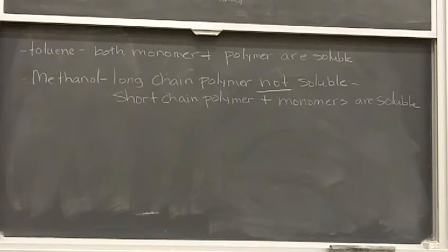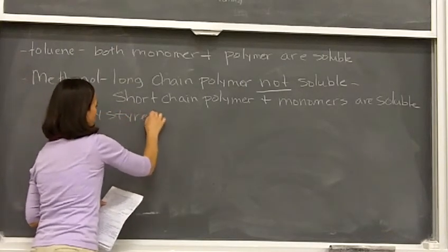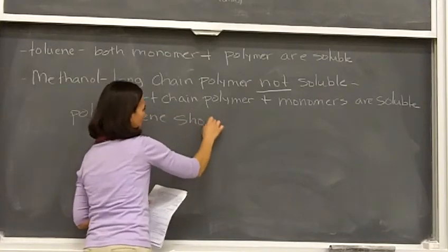Now with that precipitation, you also want to be careful. That's why I tell you to do it slowly, because you don't want to get any globs or big globby masses floating in the methanol. What that means is things were poured in too quickly, and the toluene itself is kind of stuck on the inside of the methanol. So you get these globs of toluene and the polymer kind of stuck, and it won't really form precipitate. You'll just have the globs themselves, okay? So what you want, your polystyrene should be fairly flaky, not globby.